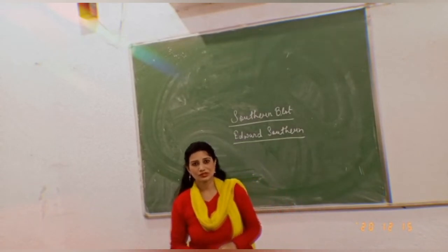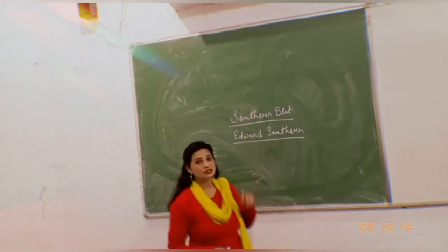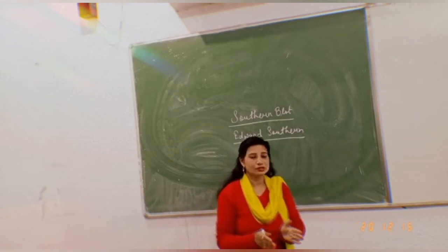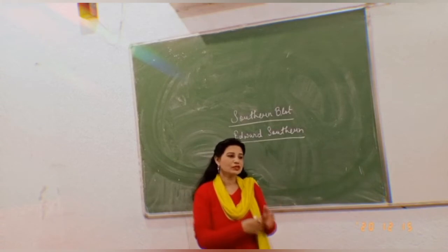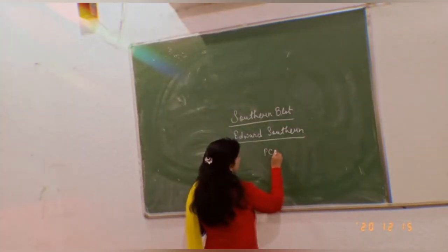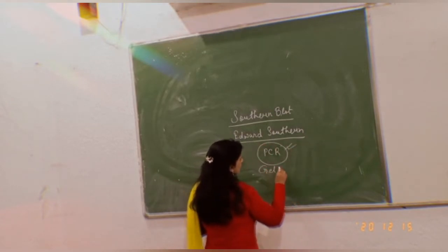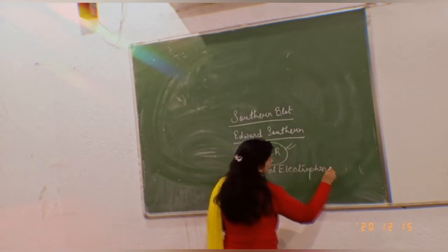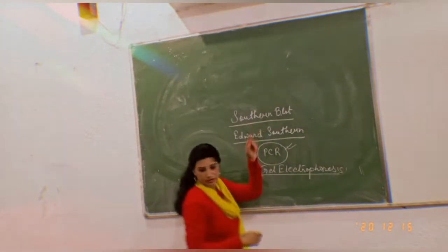Earlier in my video lectures, I have spoken about two other topics which are very related to this. First is extraction of DNA, how to open up the nucleus and the cell membrane, and then, if the sample is very little, going for the method of PCR. PCR is also a method that I have already discussed with you, and then gel electrophoresis. These are very related matters, but today's focus is not on these two. Today's focus is Southern blot.